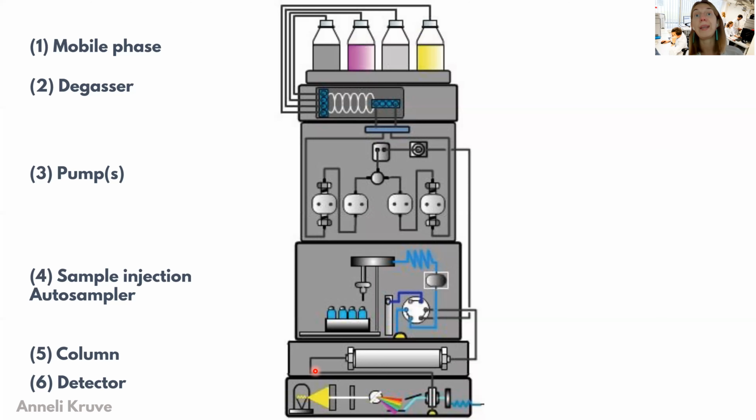But it is very interesting, and it has been developed significantly further over the last maybe 10 years. But normal HPLC apparatus has temperatures from somewhat below room temperature, maybe 10 degrees, up to 70 degrees. The limitation in these temperatures is that our sample needs to be stable at the temperature that we are using.